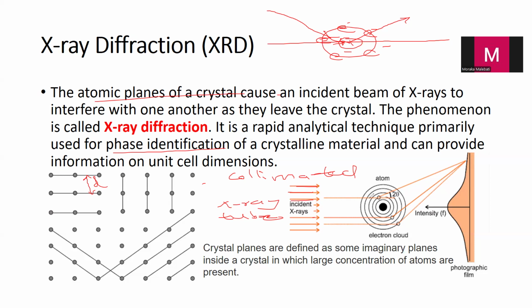Now, when these rays interact with the atom, diffraction happens. Let me extend this a bit. This is the incident, sorry.